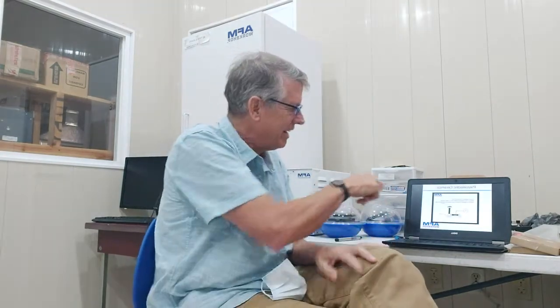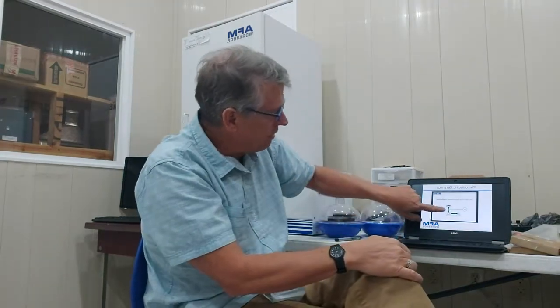So anyway, then we can put a Z ceramic here to move the sample. The sample's up here at the top. So now we can go up and down. So we can go X, Y, and Z. It's a very simple device.